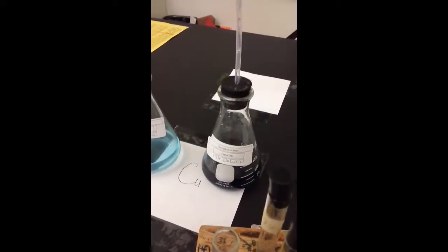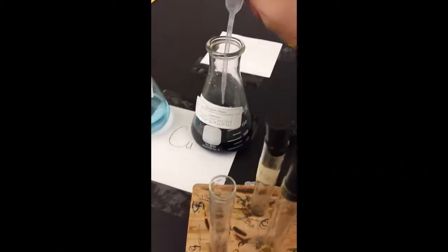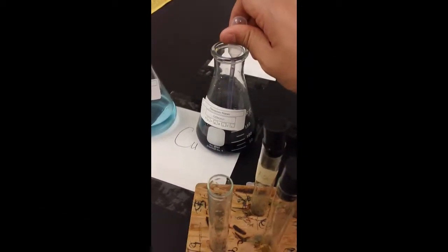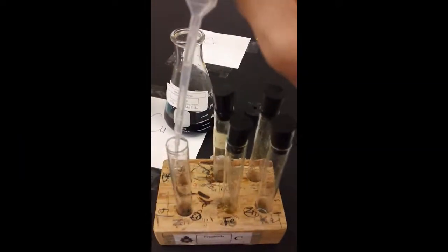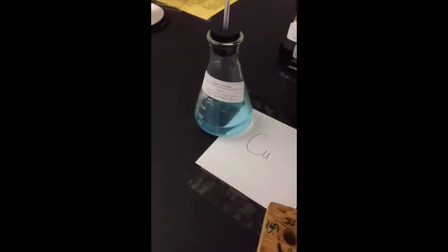So this is my Cr. If you'd like to make some observations of each of these chemicals before you run the tests, I highly suggest doing so. Okay. And we have Cr. Put my test tube stopper over there.